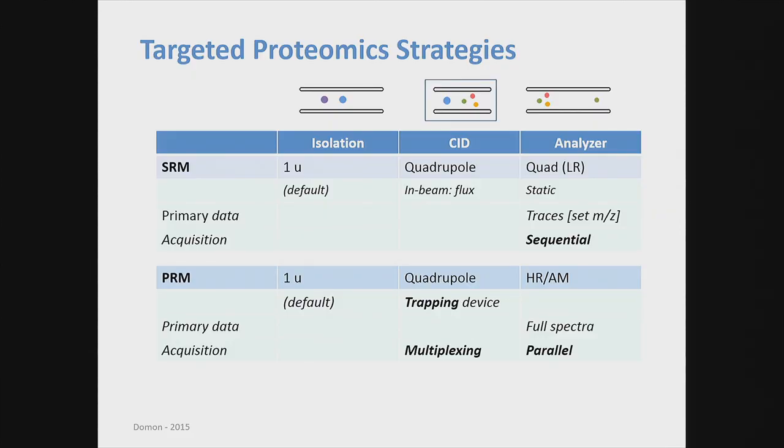What you isolate, you put into the trap, and as soon as you fill the trap, not necessarily even saturation, but you fill the trap with any ions, and you cannot overload, right? So there is a caveat here: you cannot overload the system, which you could still do here. But the advantage is if you can really select your precursor reasonably, you can trap it for a longer period of time and get very high sensitivity. You always collect full MS spectra. That means you don't have to worry upfront about which fragment you are going to use for the processing. You can do that subsequently.